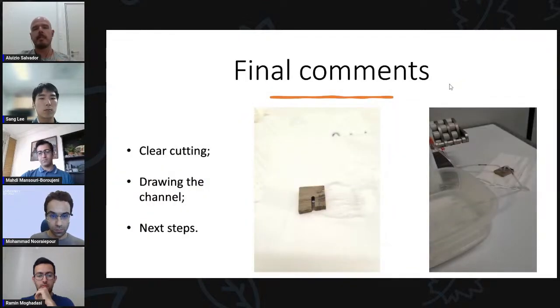So, all right, going to my final comments. It is the main purpose of this webinar. I'm also going to talk about the challenges, aka what went wrong. The first challenge started at the very beginning, which was to obtain a clean cut of the samples. We got the sample as removed, as collected from the field, with non-defined shape. And we first needed to get slices with 5 millimeters of thickness.